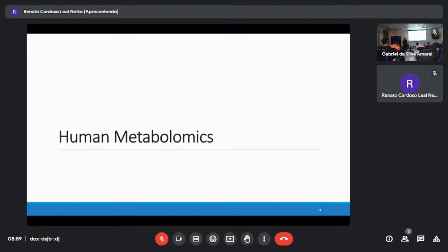And keep in mind, those kinds of compounds also can be degraded. The isoflavonoids in the microbes are biotransformed. That is the issue. But the first checking point is you have to have a list of the media.